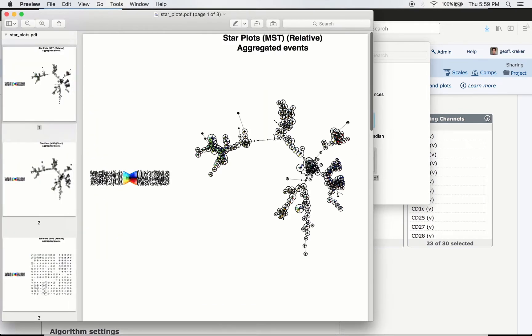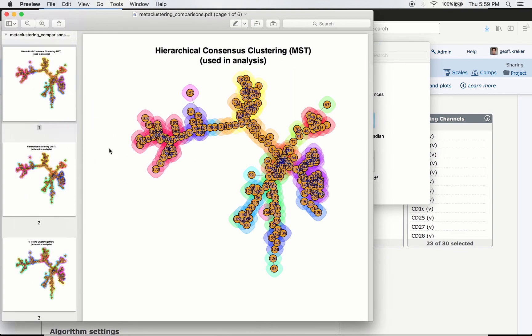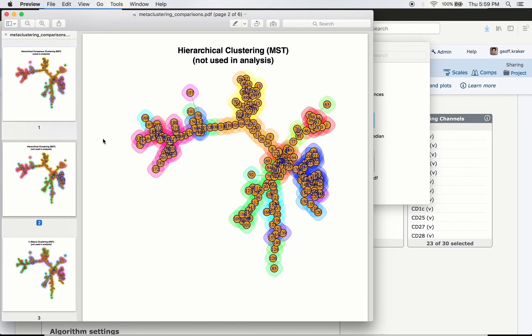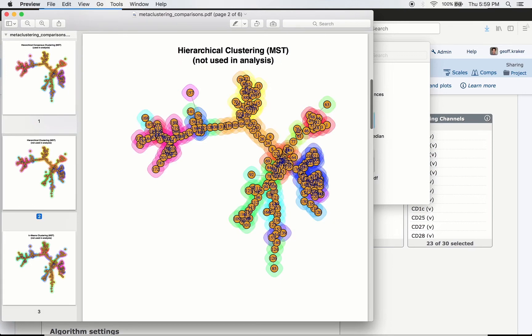There are also star plots, where each cluster node is a star chart showing the proportion of events colored by phenotype. When clusters are grouped closely together this can be difficult to read, especially with many channels. Finally, you can see the meta-cluster comparisons showing how hierarchical consensus clustering worked — and if curious, you can click to see how k-means or hierarchical without consensus would have meta-clustered your data.